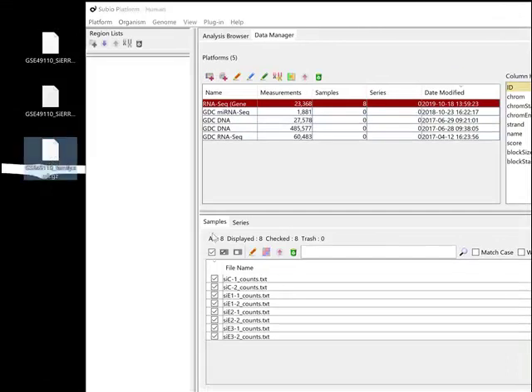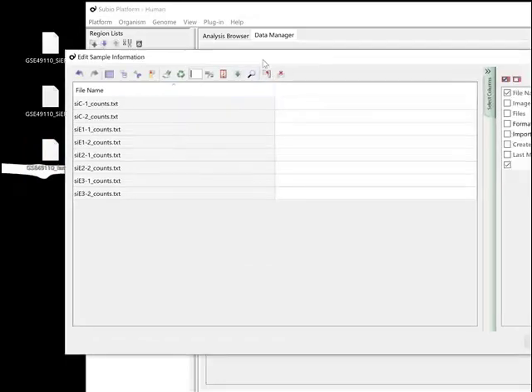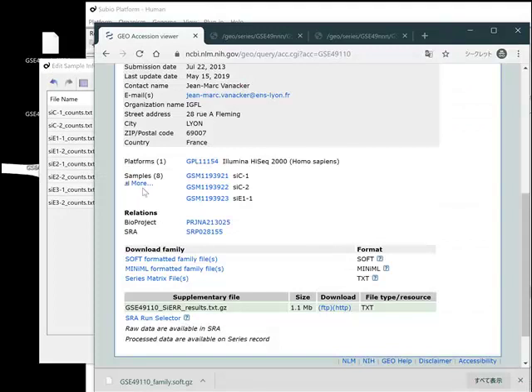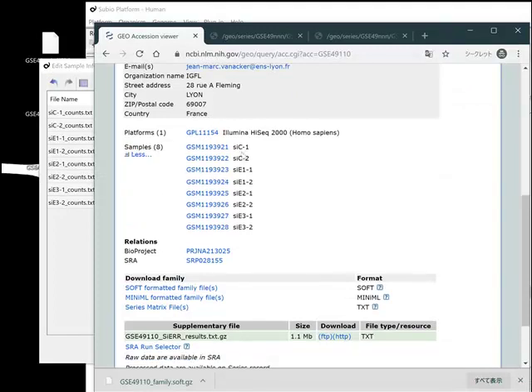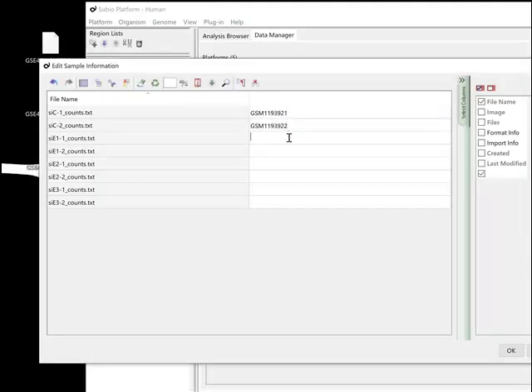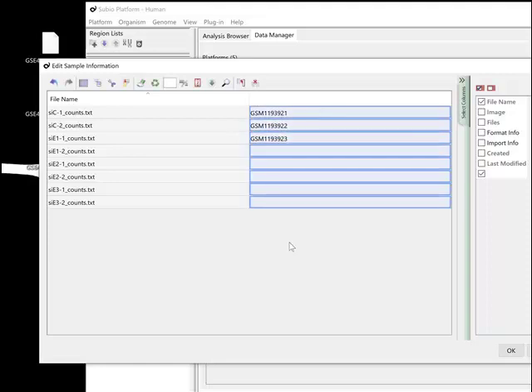Open the Edit Sample Information window. Add a column and fill it with GSM accession numbers. The Repeat button is useful to fill the rest.